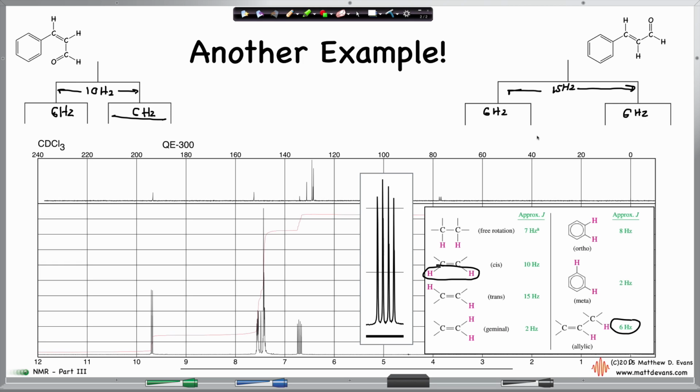So, okay, but anyways, we've completed the tree diagram, and notice that the spacing from here to here and here to here is almost the same, not quite perfectly the same, but pretty much the same, versus the spacing on this left example here, where the gap is tinier here, and then a bigger gap here.